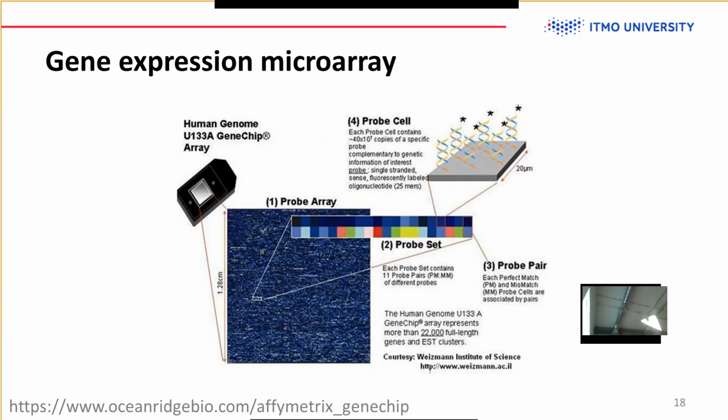This spot gets some cross fluorescence from them because the probes are not really divided. The microarray is very small, so it's basically just a photograph, and this can't be that well represented.